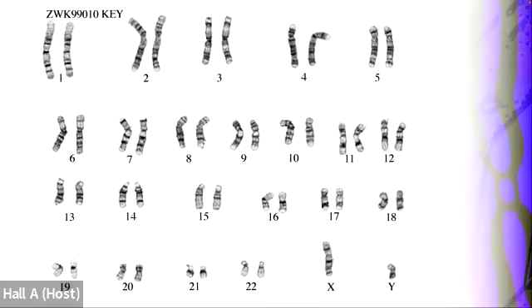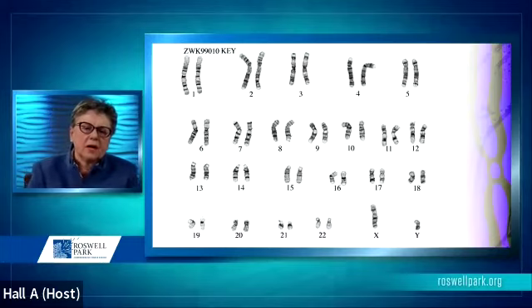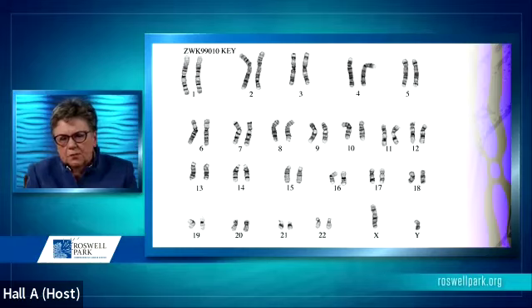This is the karyotype. This is the organization of chromosomes paired. Each chromosome pair represents a chromosome inherited from mom and a chromosome inherited from dad. The chromosomes are organized in such a way that they are largest to smallest. And this was done by early nomenclature groups, and they also were able to identify the bands on some of the chromosomes.